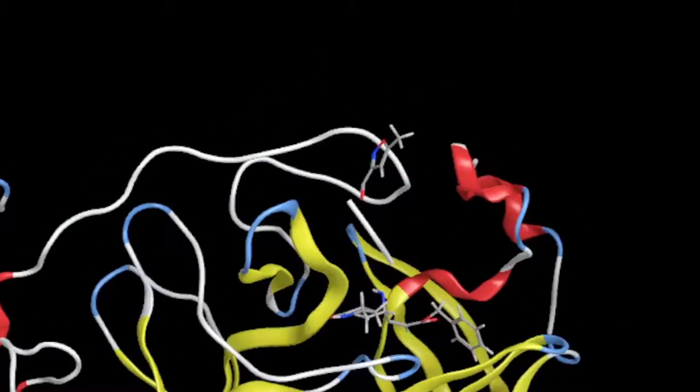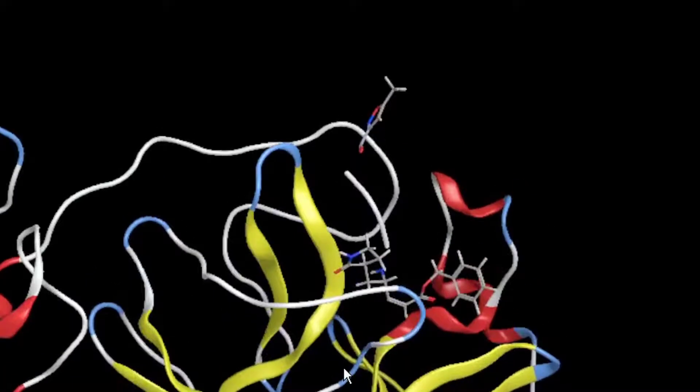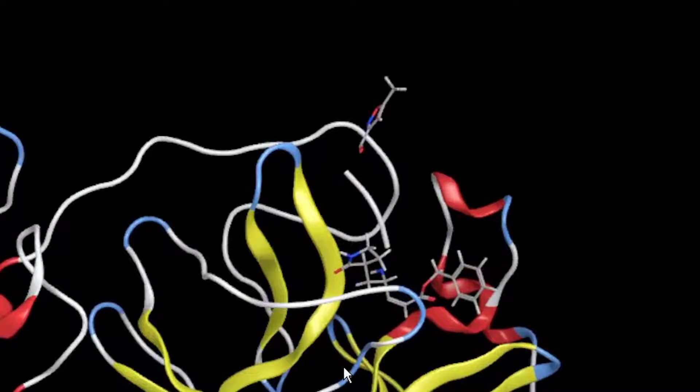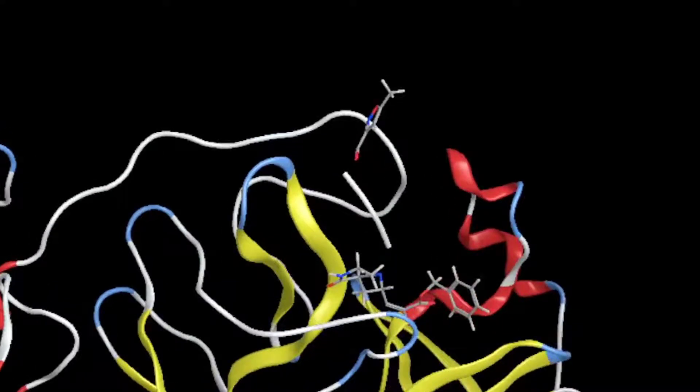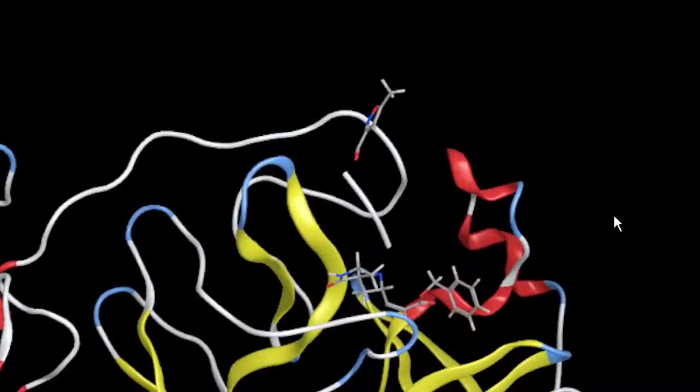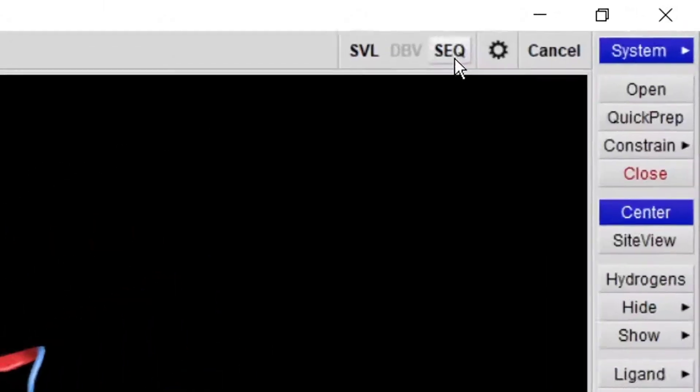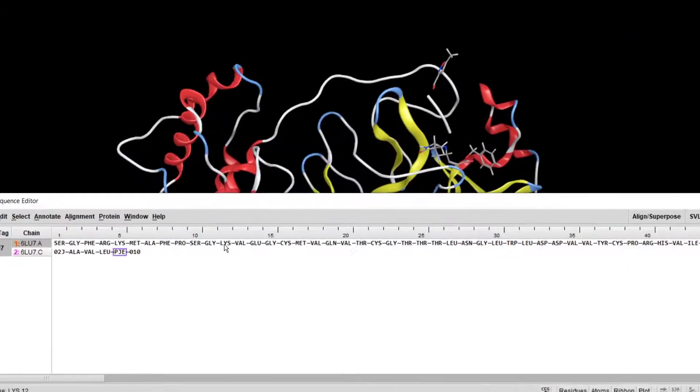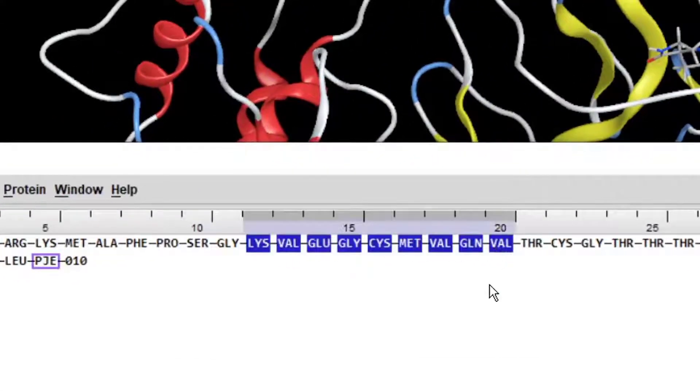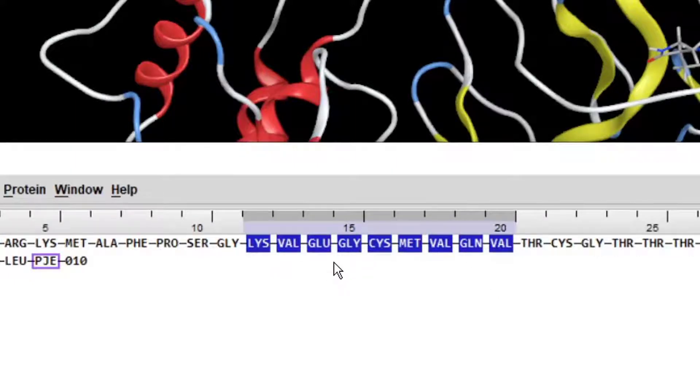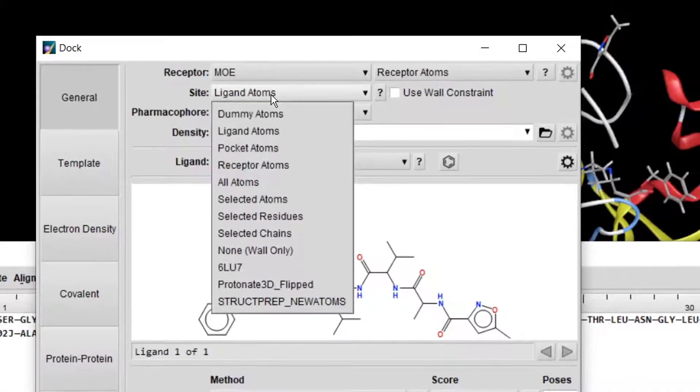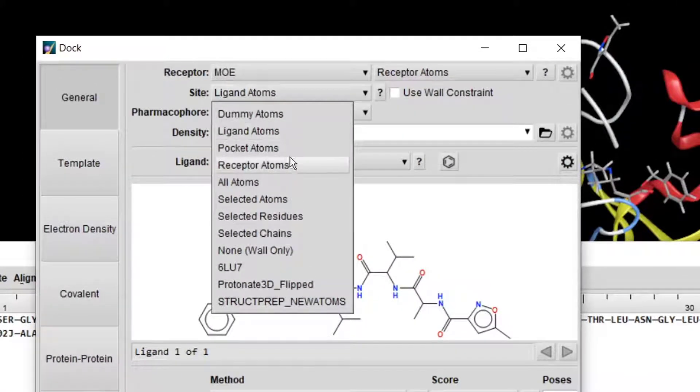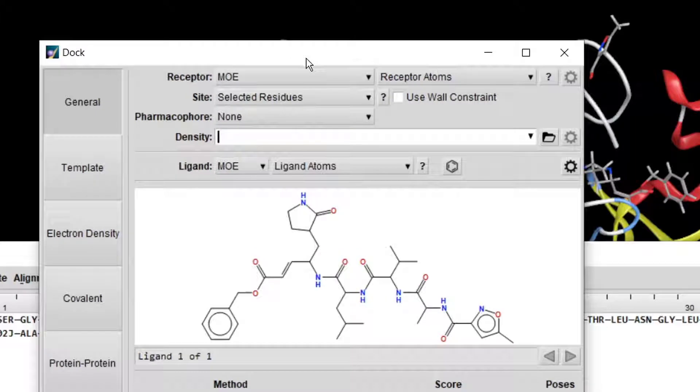We will dock our protein here because we already know the active site. If there is no ligand in your protein, then you should search for the active site residues. For example, go to Sequence and select some residues. If these are the active site residues, you will find them from the literature.